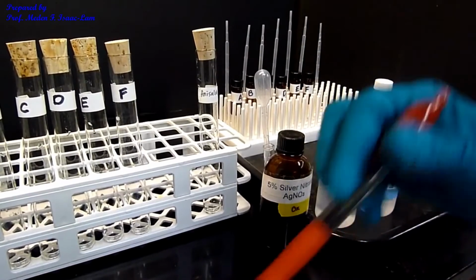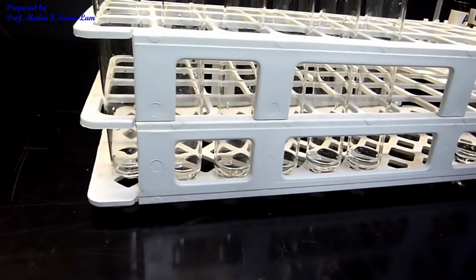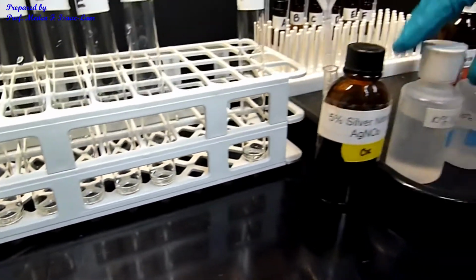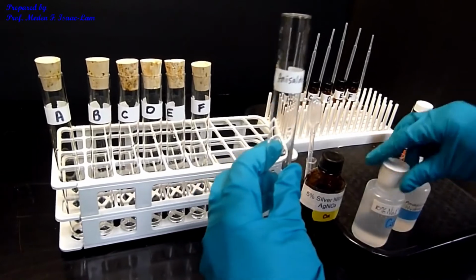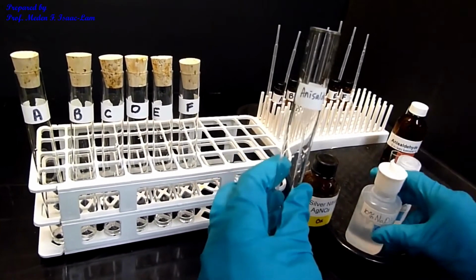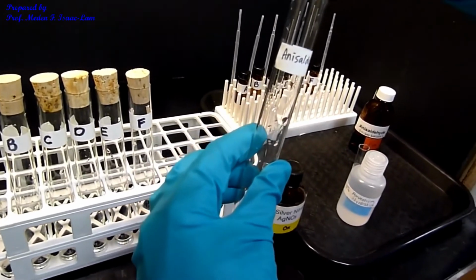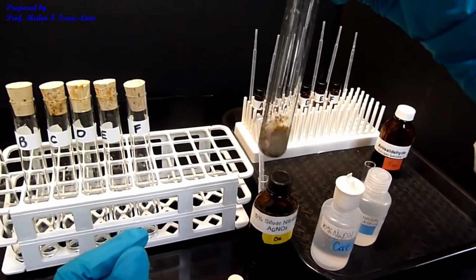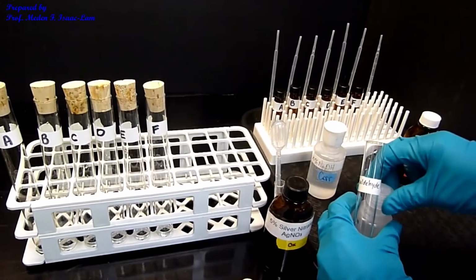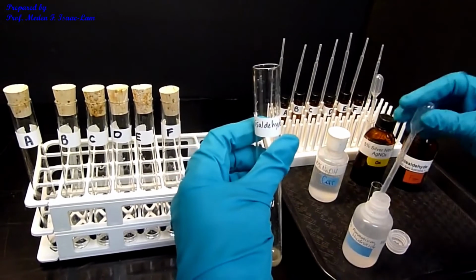And then I already added a ml of the silver nitrate in each of the tubes. And then I'm now going to add 3 drops of the sodium hydroxide. So 3 drops sodium hydroxide. So it's going to be basic. So it formed a precipitate. I'm going to add ammonium hydroxide until that precipitate dissolves.